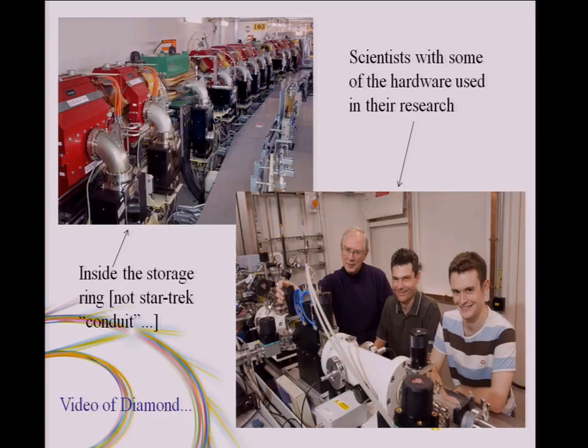So as the light comes in, it hits a sample and something happens, some signal is given off, numbers are recorded somewhere along the line. And they actually can't stand in that enclosure when the experiment's running because it's full of hard X-rays in general. So video time.